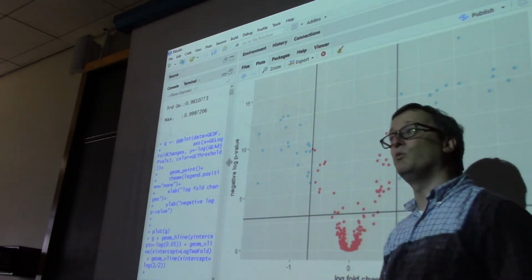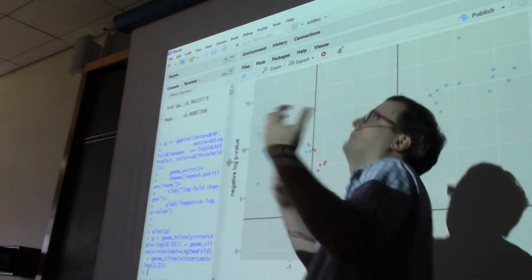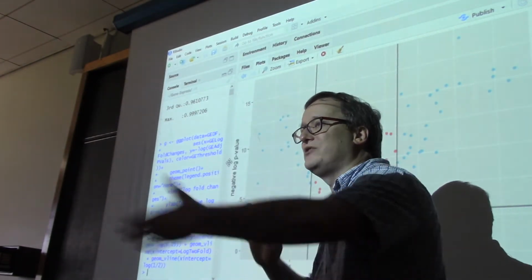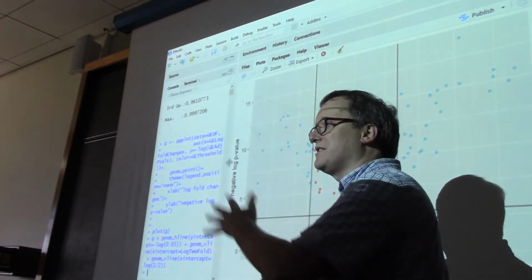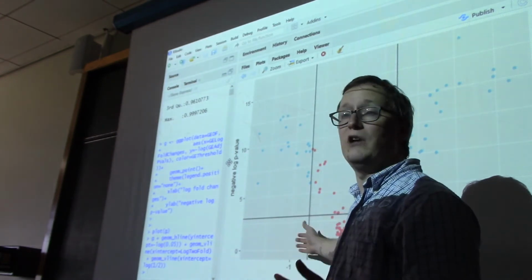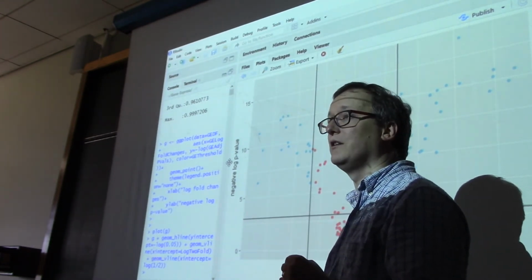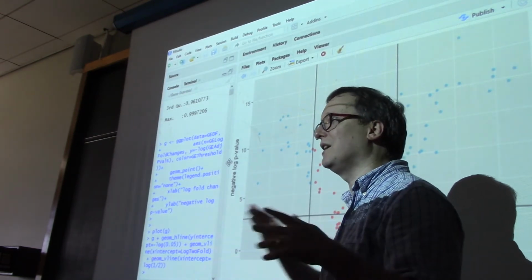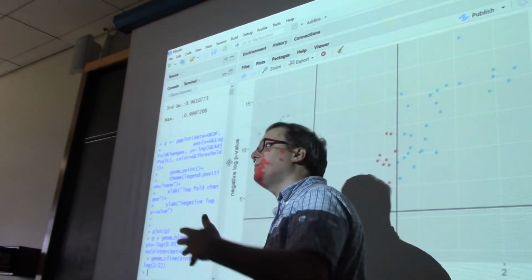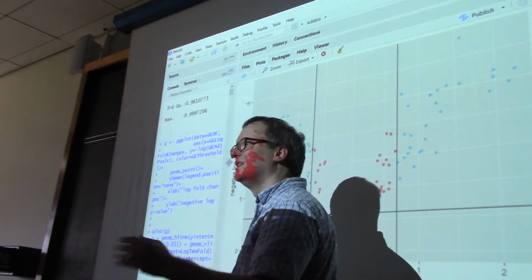You might think to yourself, well, goodness, they must be overlapping because that just looks like a big red smear down there. So one of the things that we could do is change the alpha or the gamma value of these points so that if you have a whole bunch of them, you get a nice dark color, but if you have just one, it has a relatively translucent effect. You can do stuff like that with the grammar of graphics. If you try to do that with base graphics, on the other hand, you're going to get yourself into a rather lot of programming trouble. So Ggplot makes it a lot easier to produce presentation-ready graphics.